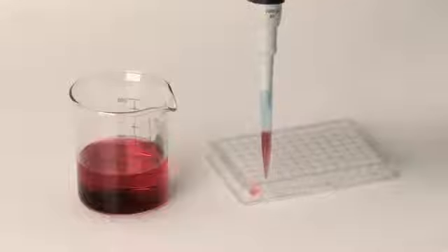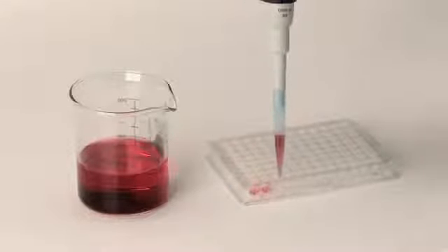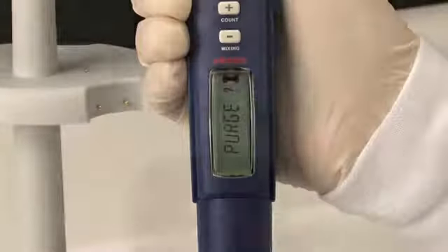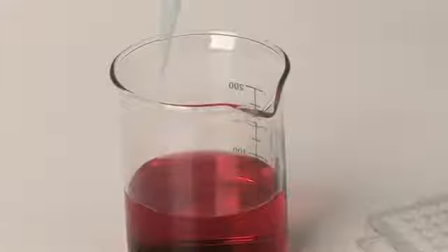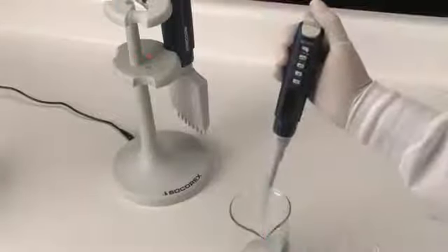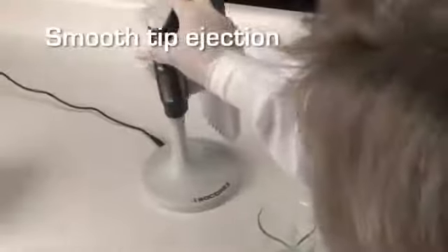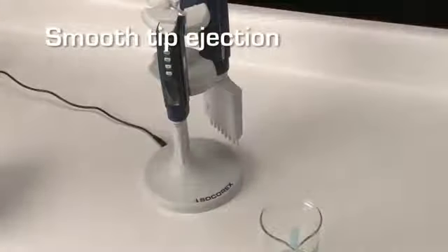The display with the triangle pointed down shows that the unit is ready to dispense. Simply push the start button to begin first dispensing. Every subsequent dispensing reduces the number of remaining aliquots. The display shows 'purge' — a double click expels the remaining liquid in the tip. Once dispensing is complete, the tip can be easily ejected by pressing the large, ergonomically located button.